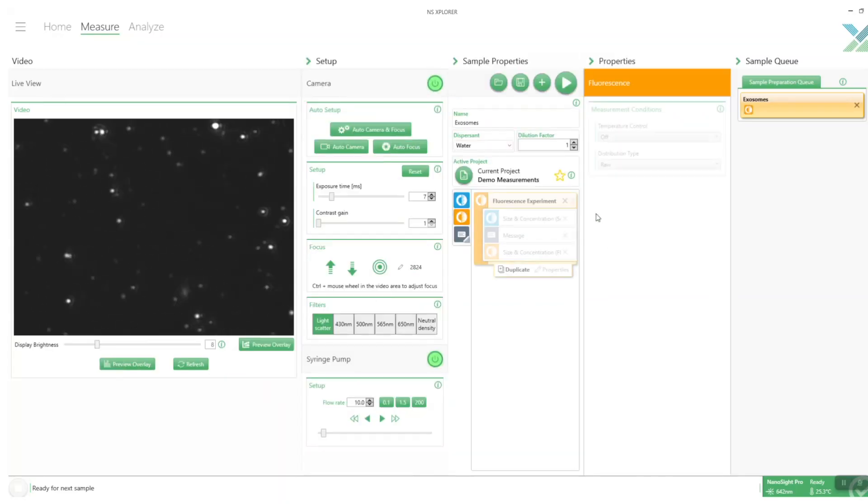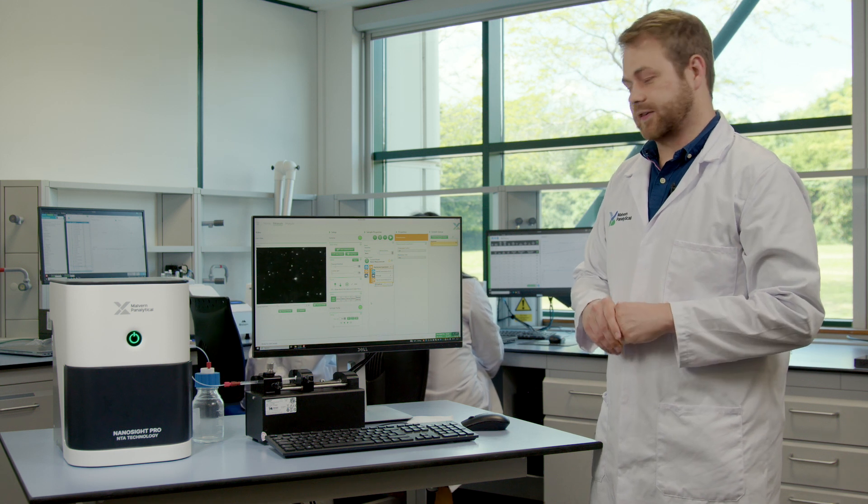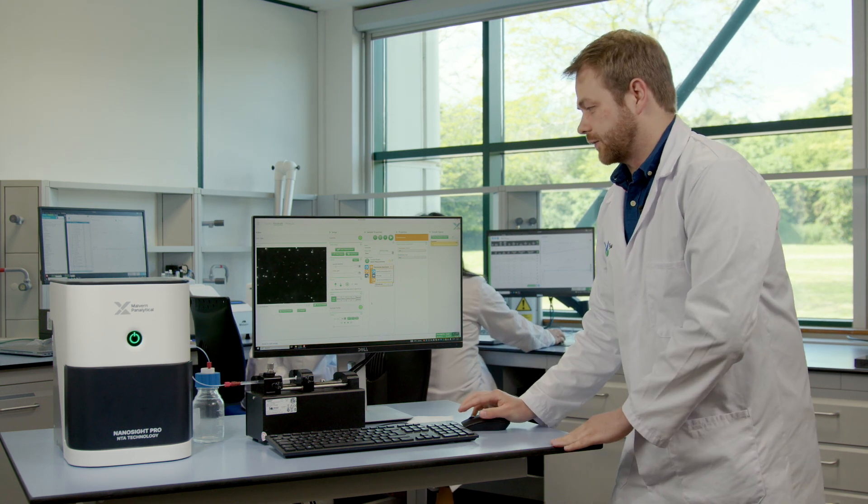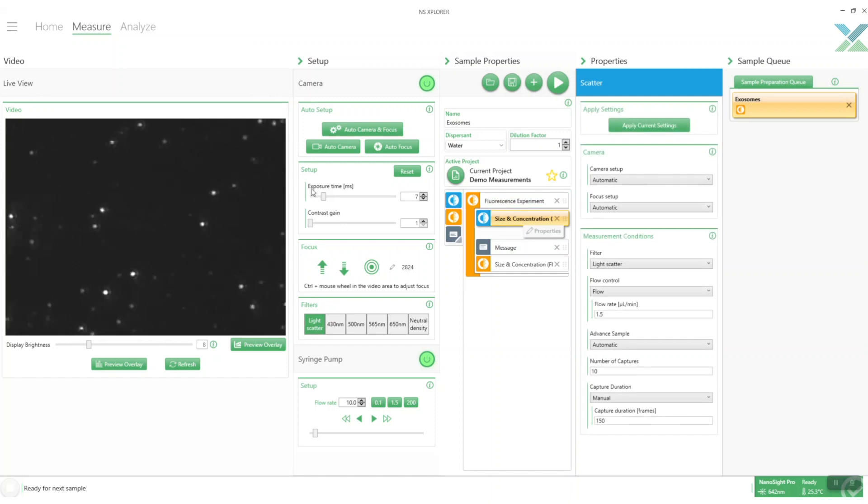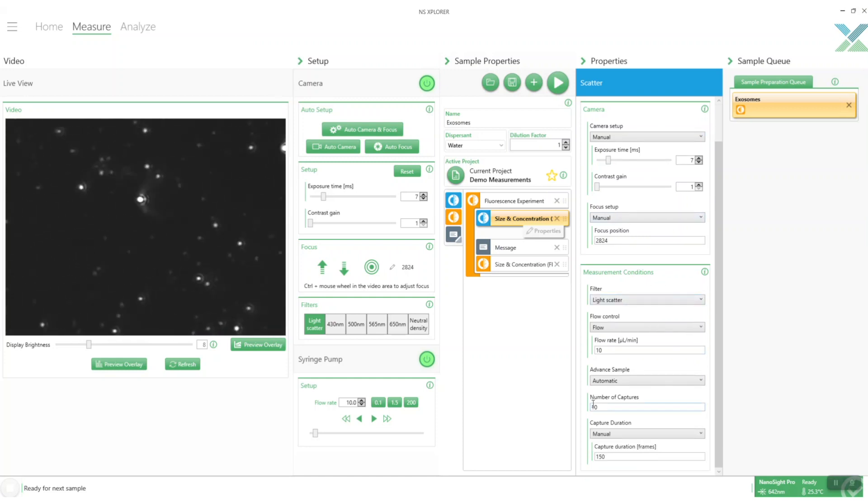We can create this here and what this gives us is a new measurement which already has the scatter and fluorescence parts built in. For the scatter part to set this up we've already got our settings here so we can just click apply current settings which gives us them all over here and I'm just going to lower the number of captures to keep the measurement shorter for this demo.